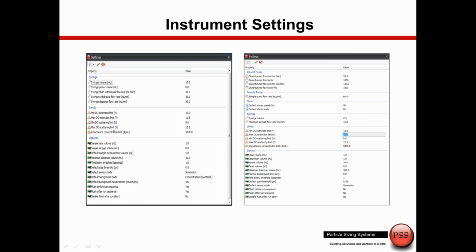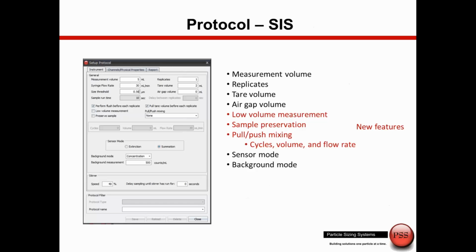This is one of the first things you do when setting up your system, and it is very helpful, being able to set up these voltages for your sensor. We can constantly look at your voltage settings, and if we ever exceed or go under these settings, you'll have a warning, or you could actually stop the measurement. This is another way to make sure that data is only collected when the instrument is within proper operating parameters.